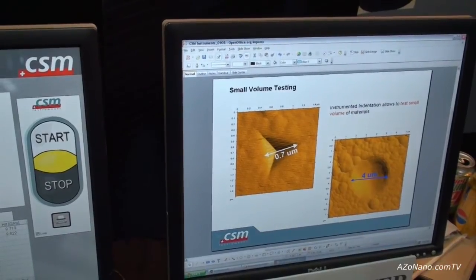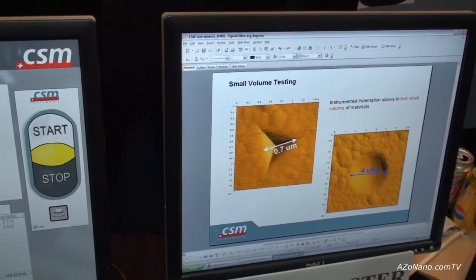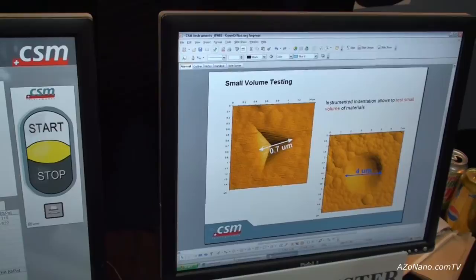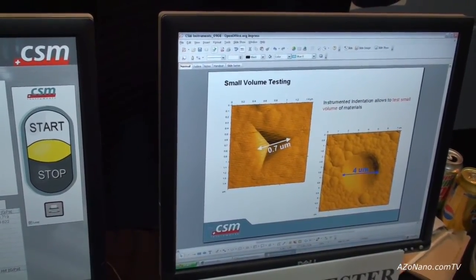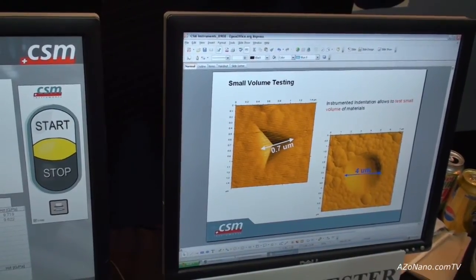But it's designed for the industrial market, so for quality control. And I think it's one of the only nano indentation machines on the market which retails for less than $100,000. And that is a milestone, I think, in their development.